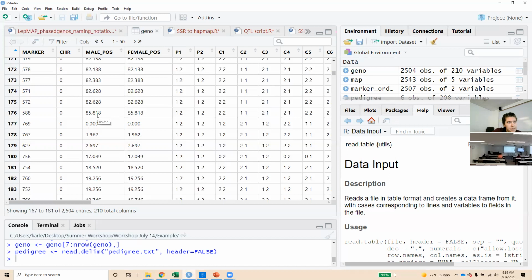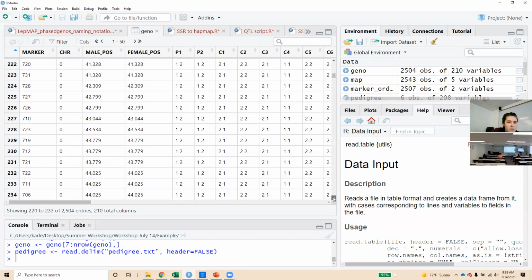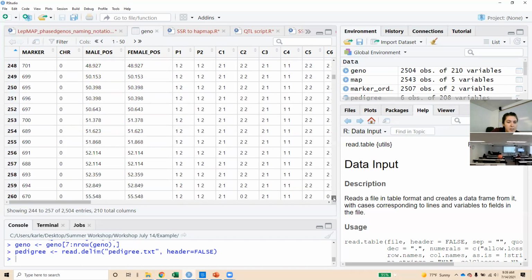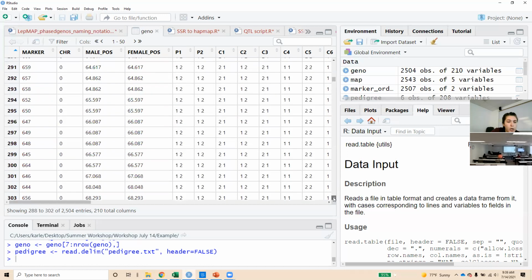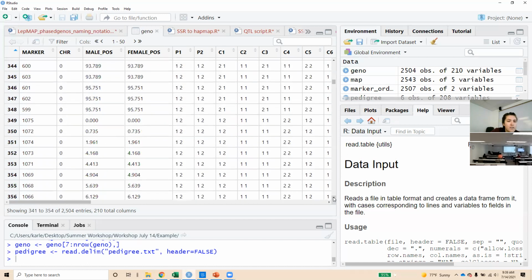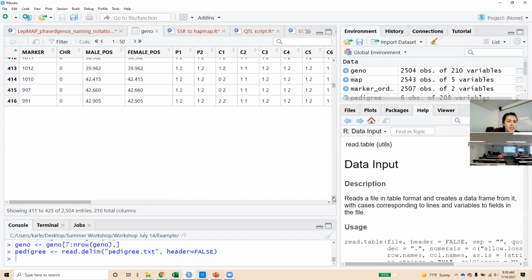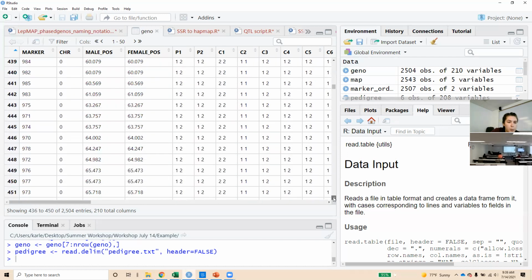So we will do this manually. No, this is within the R script. I have defined that whichever row has a 0 in it is a new linkage group, with the exception that sometimes there's double zeros at the start, like 2 markers are at the same position, and that's a 0. I would only count the first of those zeros as a new linkage group.